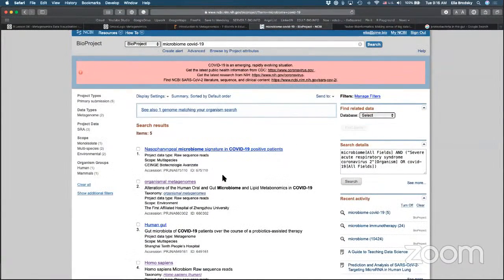So again, you can look at some of these data sets to just get a sense of whether there's a data set that you can ask these questions of, and then read a little bit about how the data was prepared, what the data is showing, to understand whether what you're asking is a reasonable direction, right?